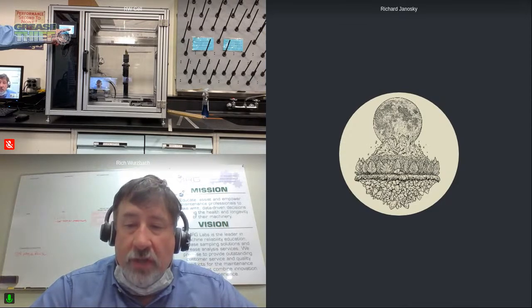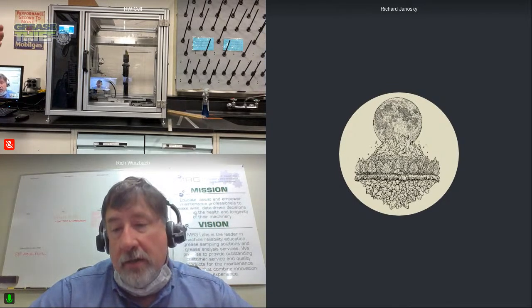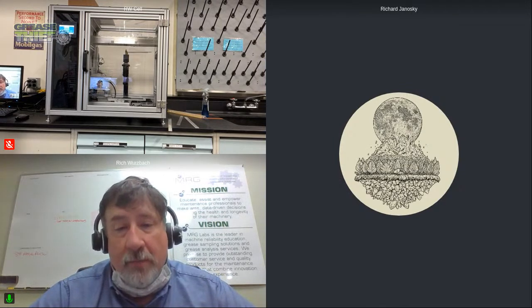So that was real helpful, Richard. You showed us the way to use the analyzer. You shared some data with us on how that data then gets compared to the baseline. And we've talked a little bit about developing criteria, having maybe a default criteria of plus or minus 20% of that 100 index value, which would be our target, but also about changing that when it needs to be somewhat different depending on the specific application.